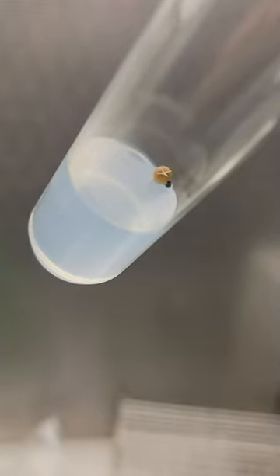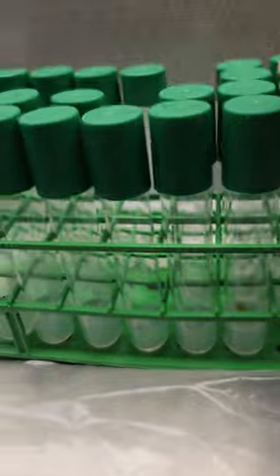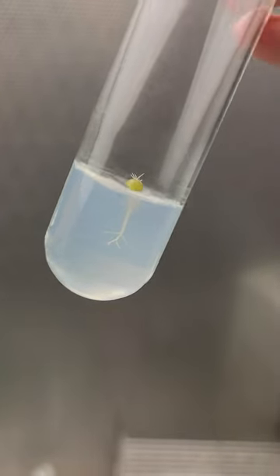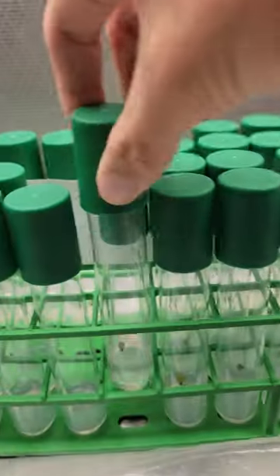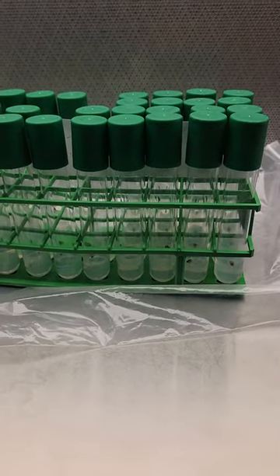It's got some nice spikes on it — little baby spikes. And then this one right here has some really impressive roots. Such a massive taproot there. These are just on some MS Medium and I'll be posting more updates.